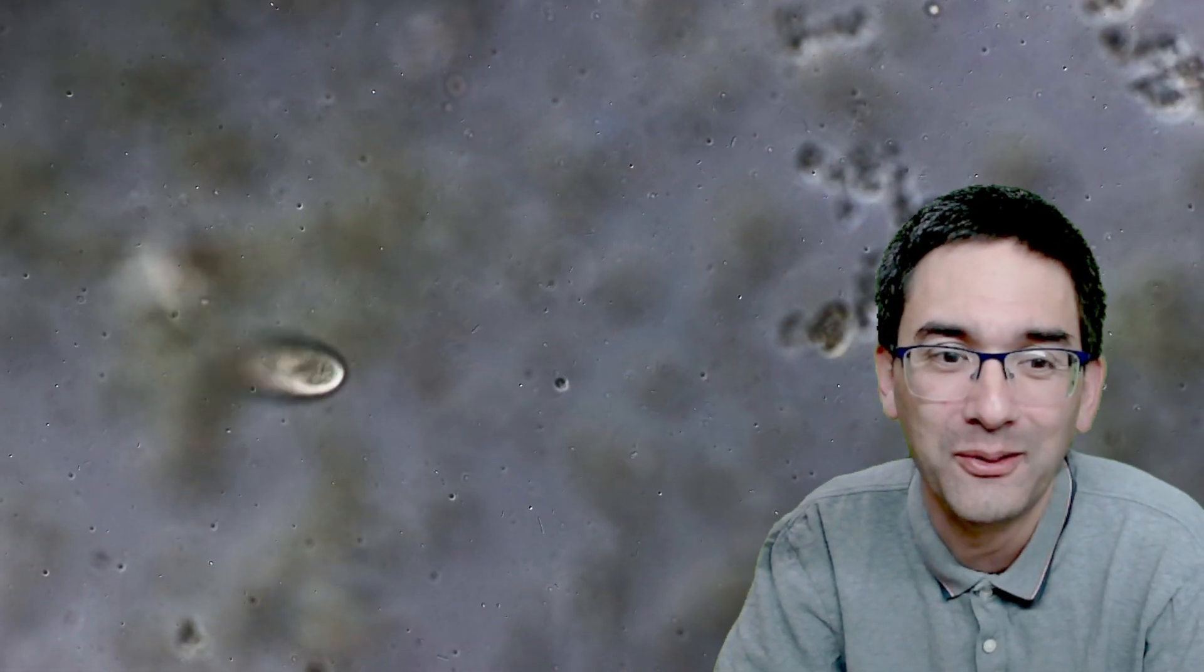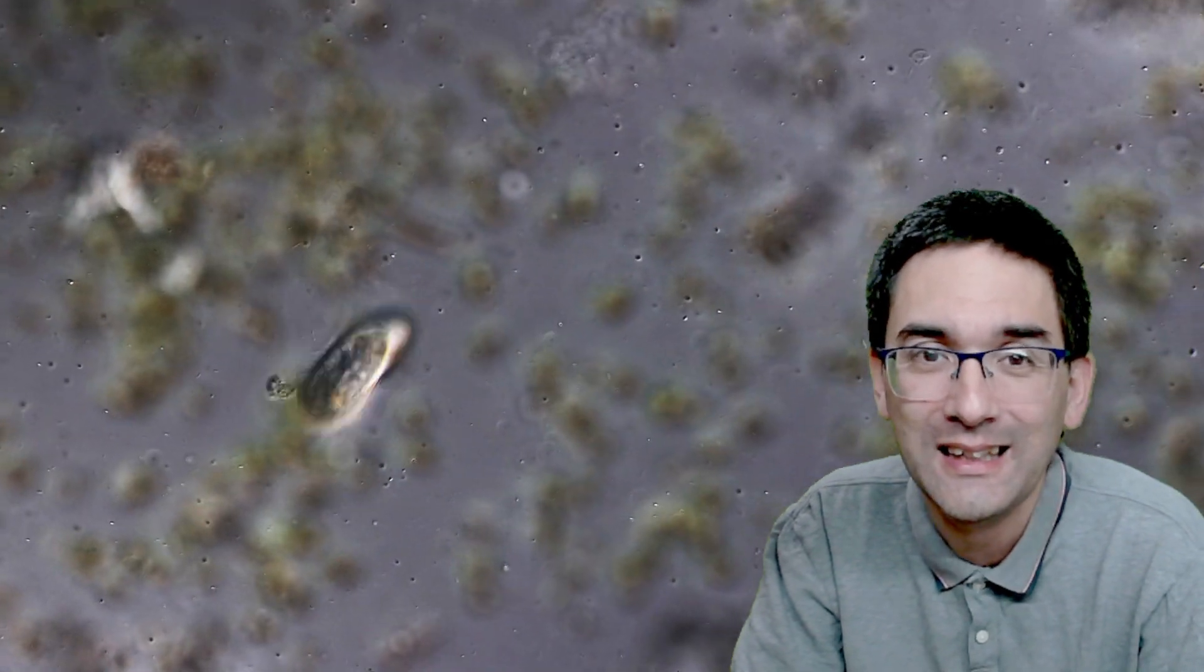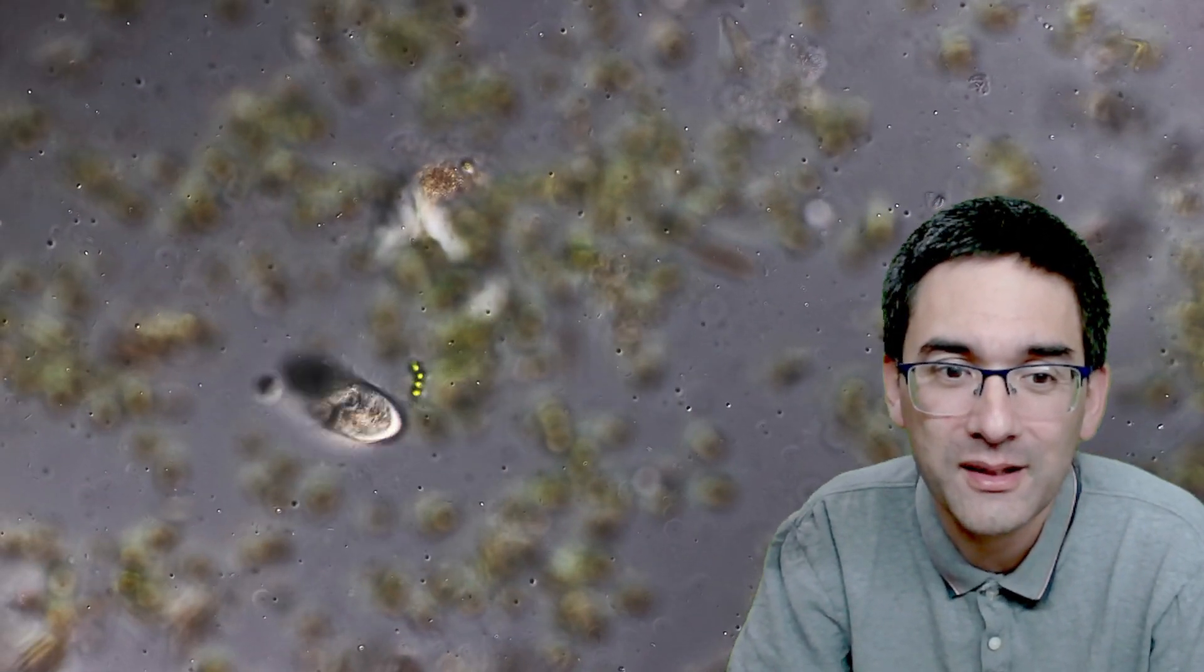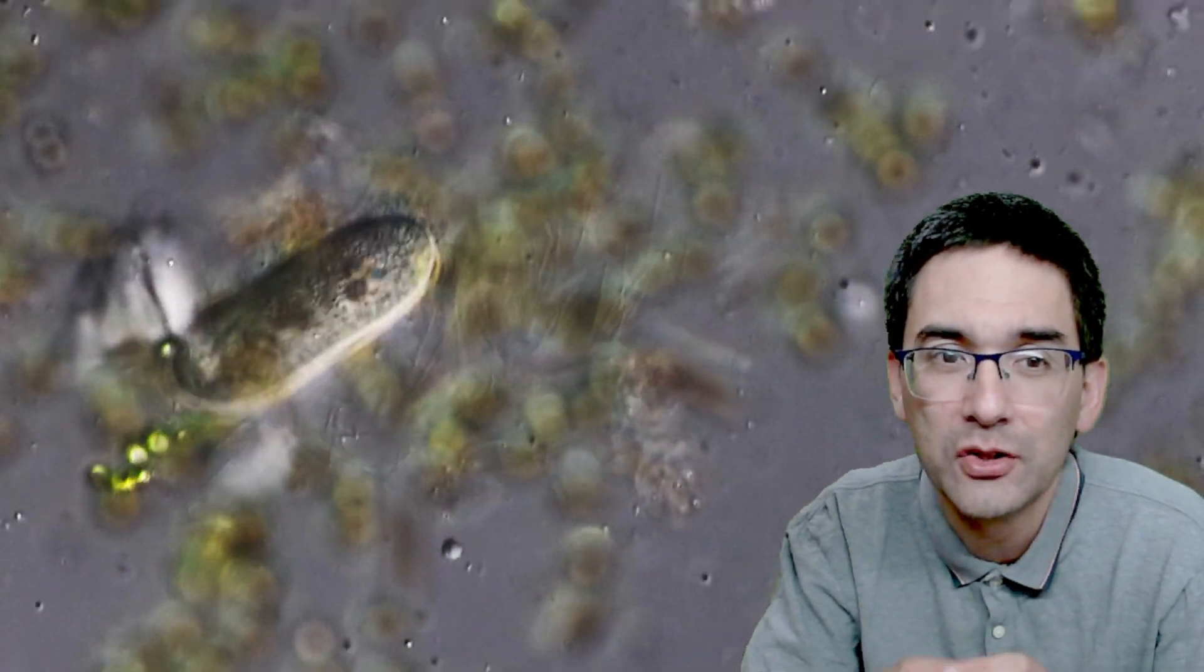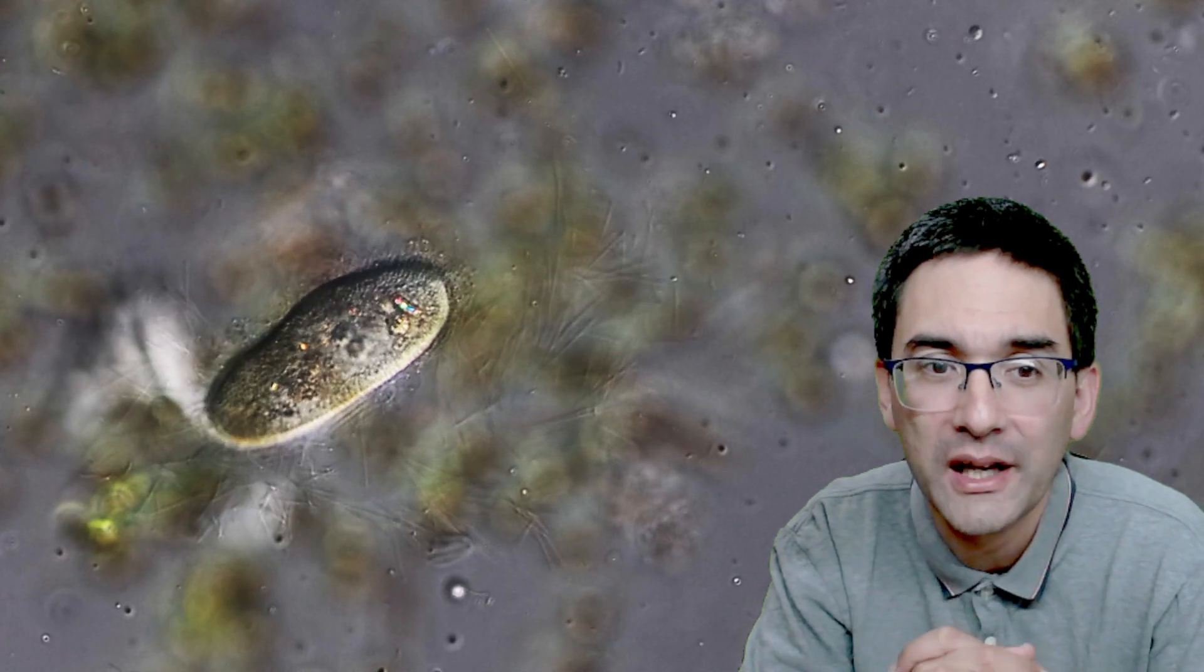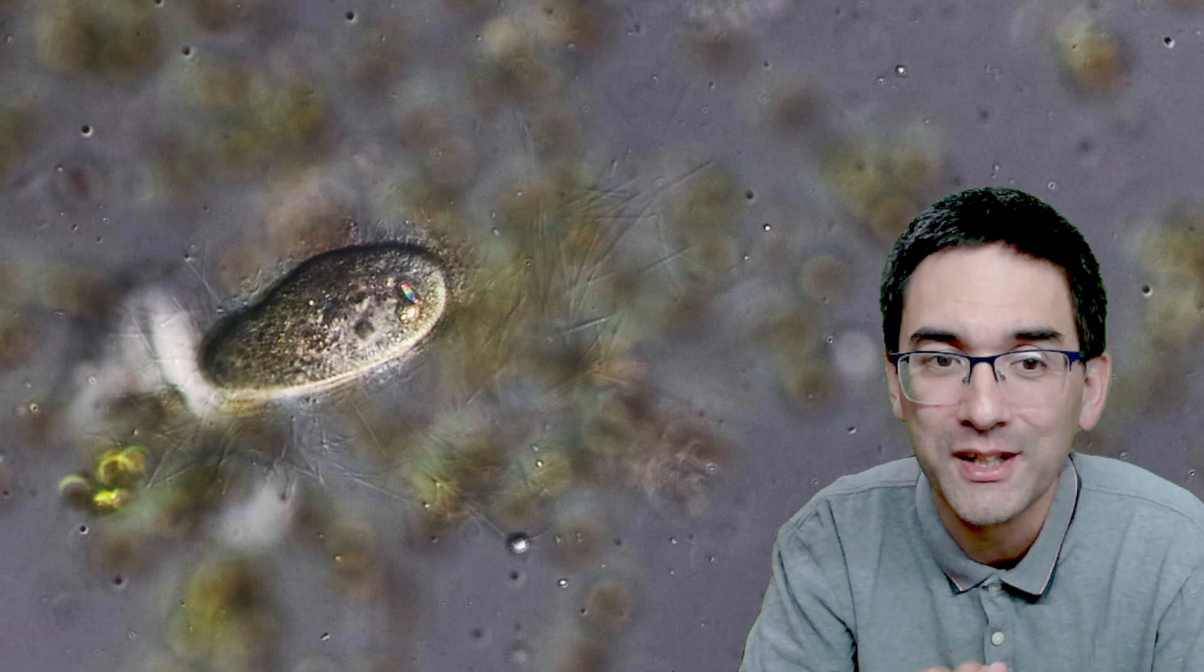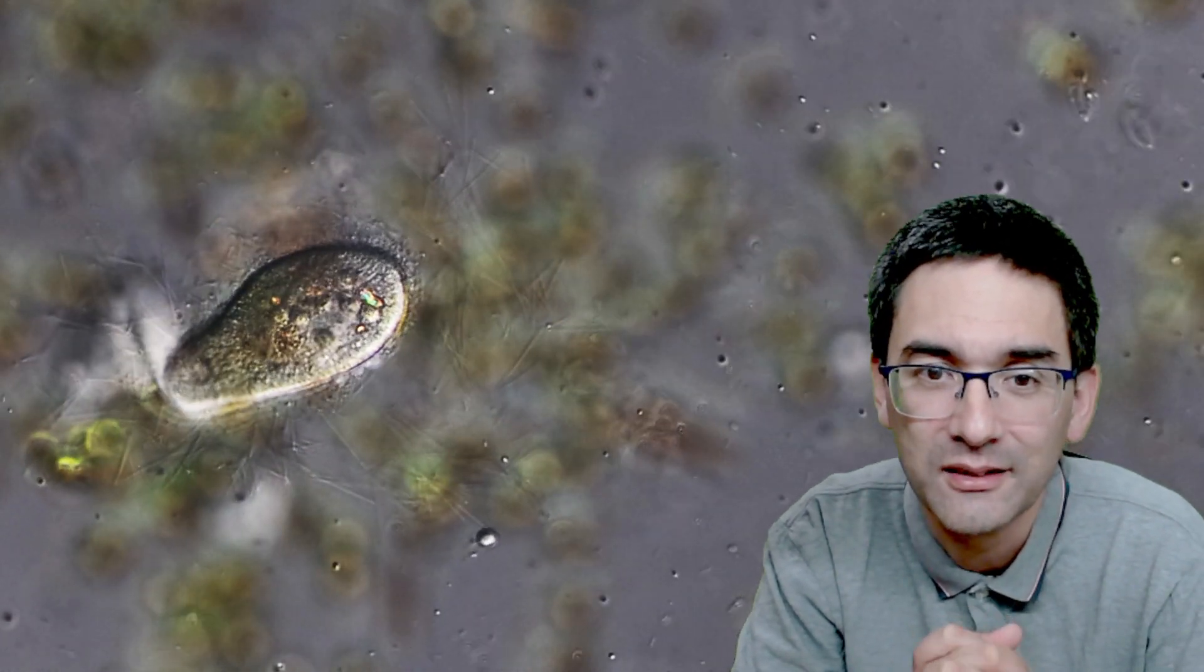Look what happens now—it just managed to escape! Oh no, it didn't. Too late. It starts to spin again, loses control. That's the end of it. Let's simply watch this a little bit. I guess it's also trying to break down the hydrogen peroxide, but the concentration is simply too high. It's not able to manage this. Then it will stop moving after a few seconds. That was it for this little microbe here.